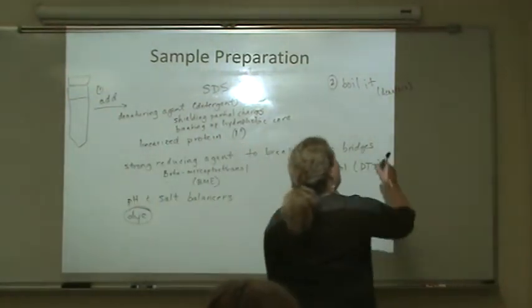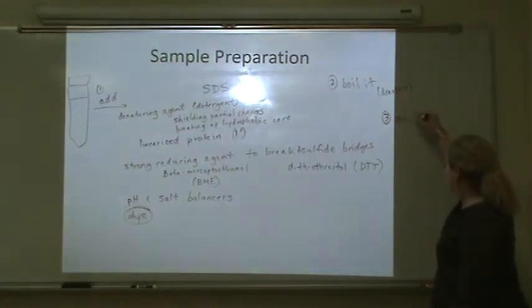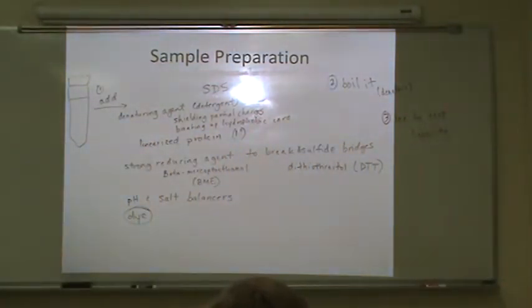Also, really, there's a number 3 step. Let me think about this. Sometimes you ice it and sometimes you don't. I feel like I have loaded hot protein and I've loaded cold protein. Some protocols will ask you to boil it and immediately load it. Some of them will ask you to boil it, plunge it into ice, and then load it later.